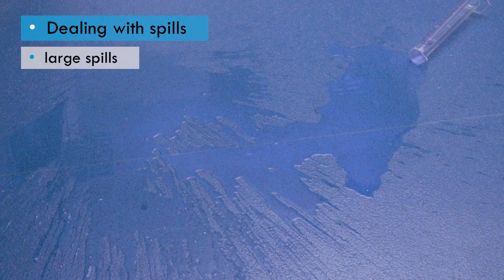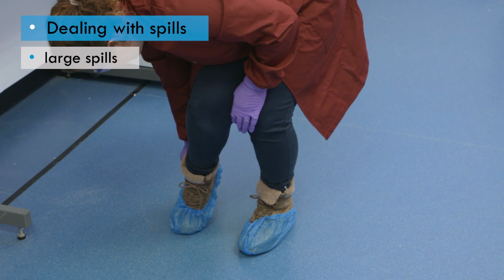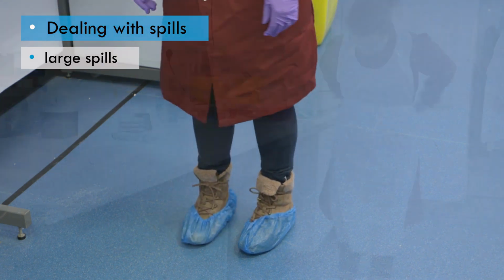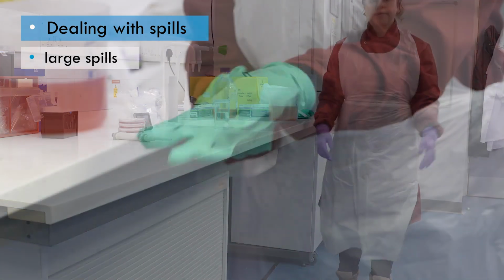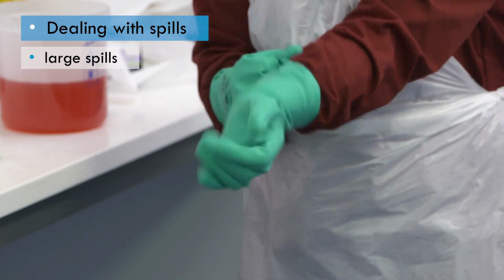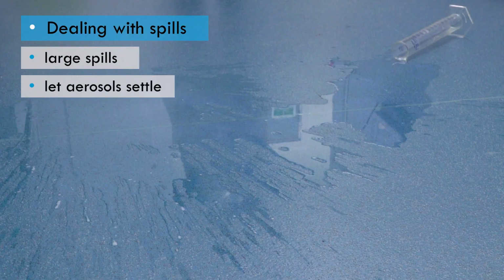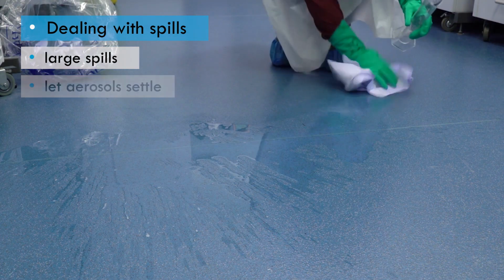When clearing up large spills, there's a greater risk of splashing, so you may need additional splash protection, such as disposable plastic shoe covers or rubber boots, a plastic apron to protect the lab coat, and gloves that will protect against the disinfectant. Where possible, leave the area and allow any potential aerosols to settle out before returning to mop up the spill.